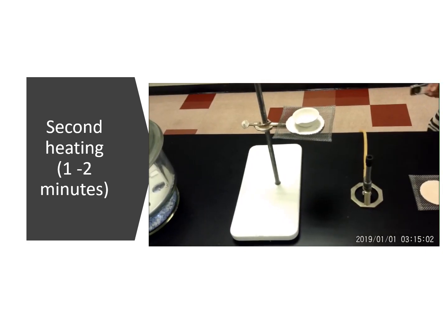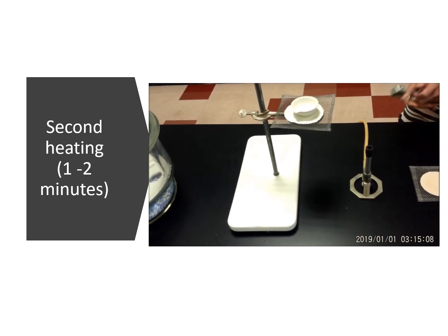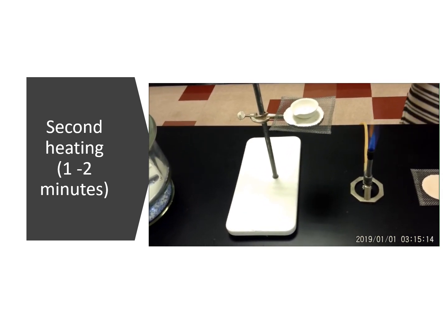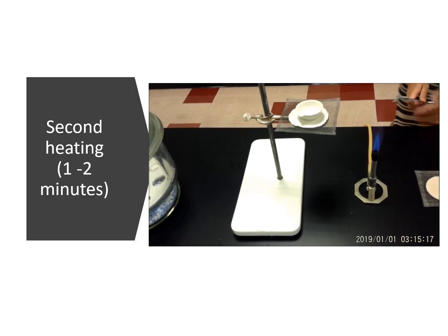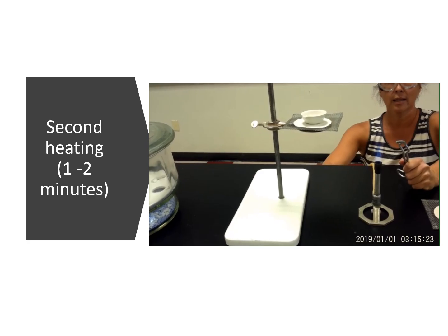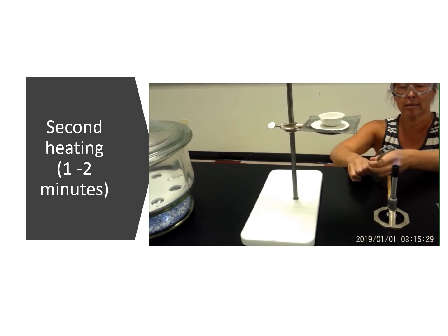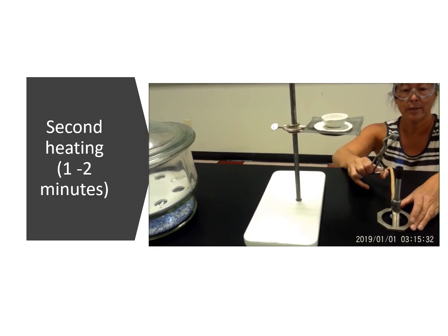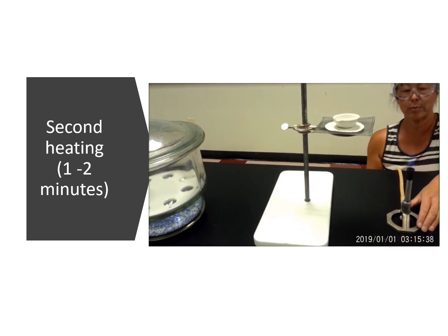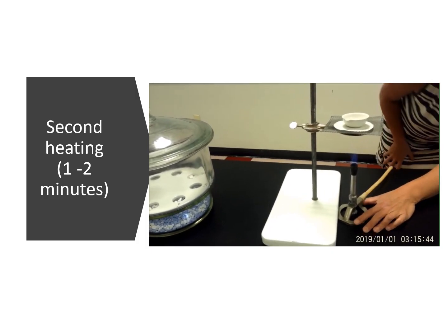We're going to go ahead, get our sample set to dry again for our second heating. Let's go ahead and light up our Bunsen burner. Okay. Notice again, this is very low compared to the height. So what we're going to do is adjust our flame so it's a gentle heating. Okay. So here is going to be the hottest part of the flame, so here should be cooler. You can increase the gas if you need to, but we want to be very careful when it decomposes. What we'll do is we'll just heat it gently.